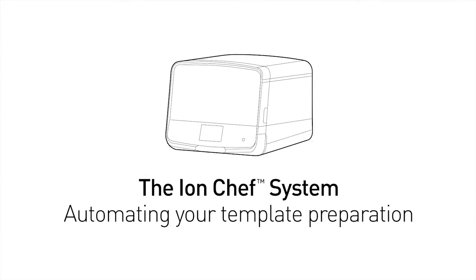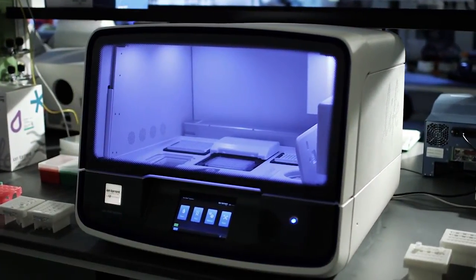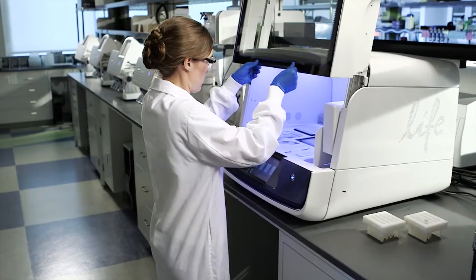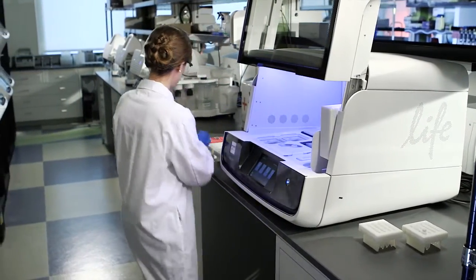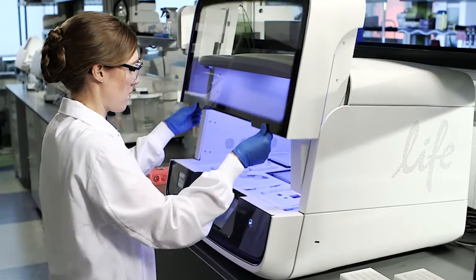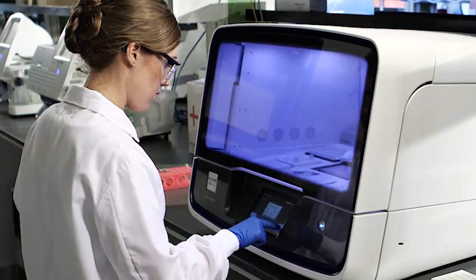Introducing the Ion Chef system, a fully automated template preparation solution for Ion PGM and Ion Proton sequencers. The Ion Chef system fully automates preparation of template from libraries and performs chip loading to provide sequence-ready chips. The system delivers walk-away automation to help maximize your lab's productivity and minimize sources of variability.